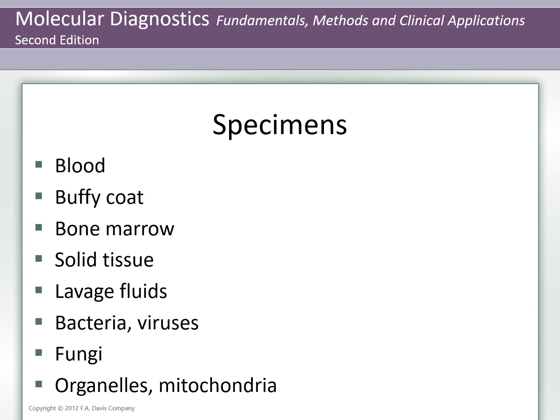Nucleic acid is routinely isolated from human, fungal, bacterial, and viral sources in the clinical laboratory. See Table 4.1 in your textbook that shows a summary of the yield of DNA from different specimen sources. Pretreatment may be necessary to make cells available from which nucleic acid will be extracted, depending on the type of specimen. For example, white blood cells in blood or bone marrow specimens are removed from red blood cell and other blood components by either centrifugation or lysis.